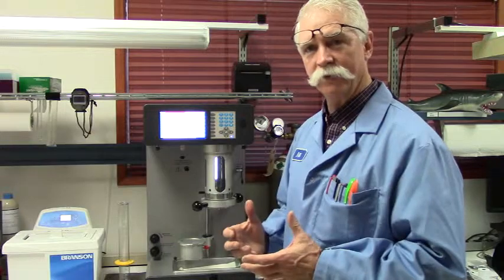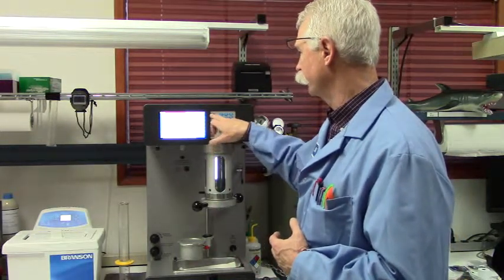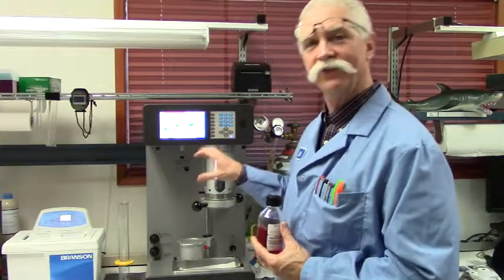Once that is set up, go back to the home screen, go to sample, and hit start recipe. Now we're ready to do our sample prep.